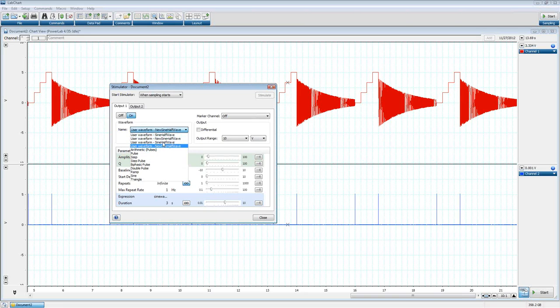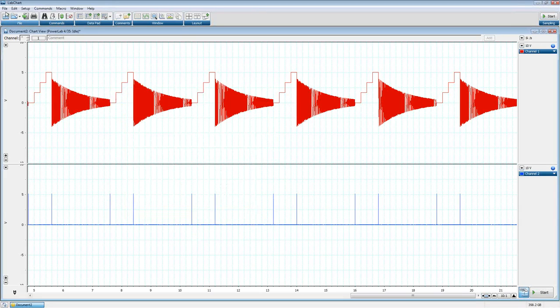And it appears. What you're seeing here, that they're doubled, is just a slight issue in the software that we're aware of and we're actually working on. The names get repeated, but it doesn't matter whichever one you click on, you'll go there. If you update this one, it'll update the other one as well. But I'm going to go to my new sine half wave. We'll close this.